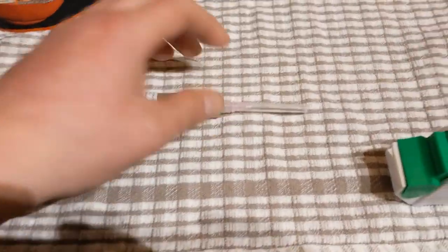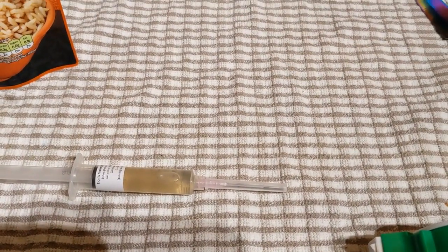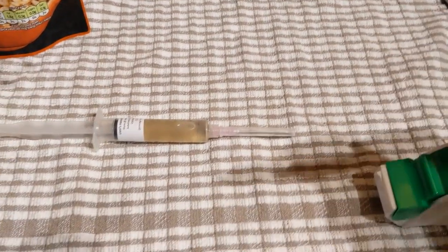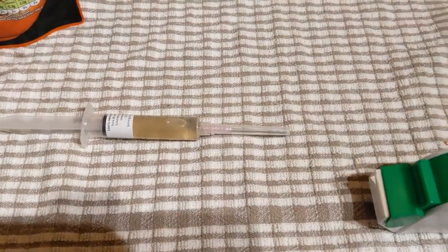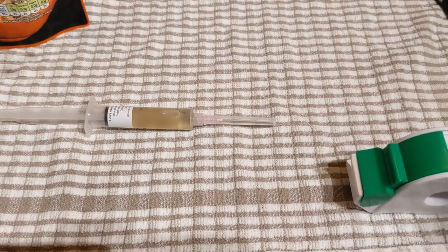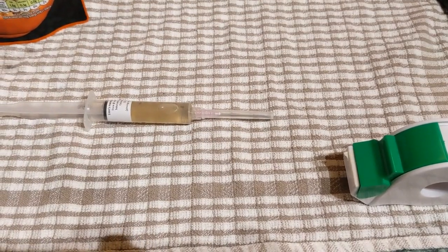They should come, I mean, they came from a sealed pack. The needle itself, I just took it out of the pack and popped it on there, but they come in these sealed packs from the manufacturer, so it should be okay. I might be going a bit overkill with this, but you better be safer than sorry. It's the first time we've ever done it, so let's do it right, yeah.